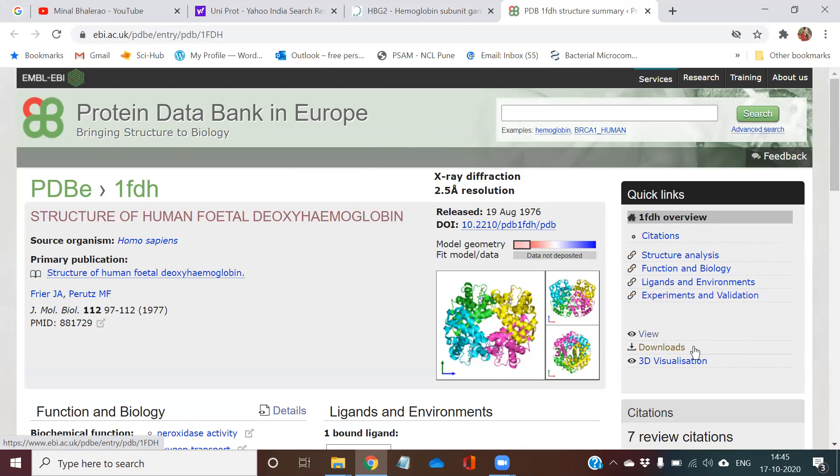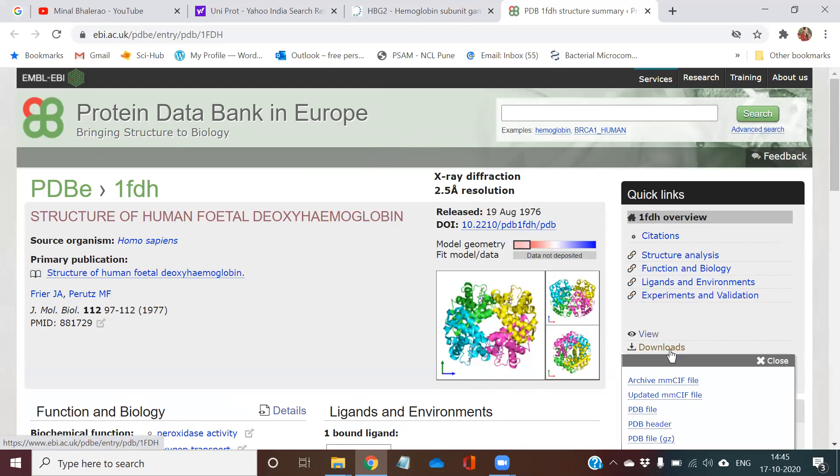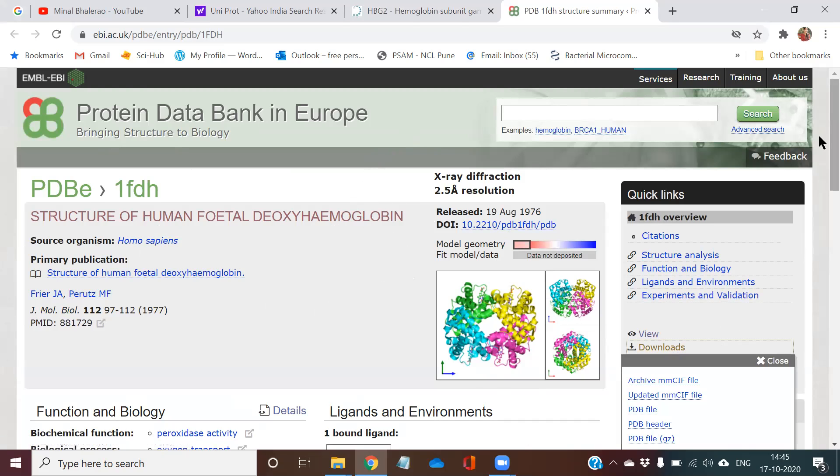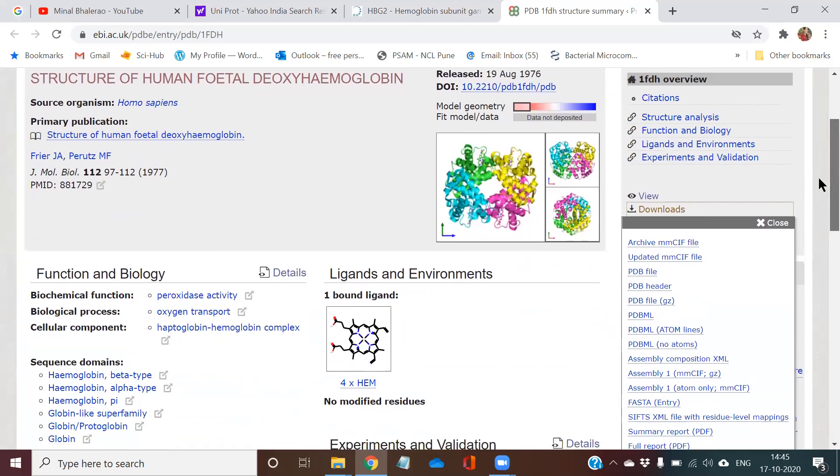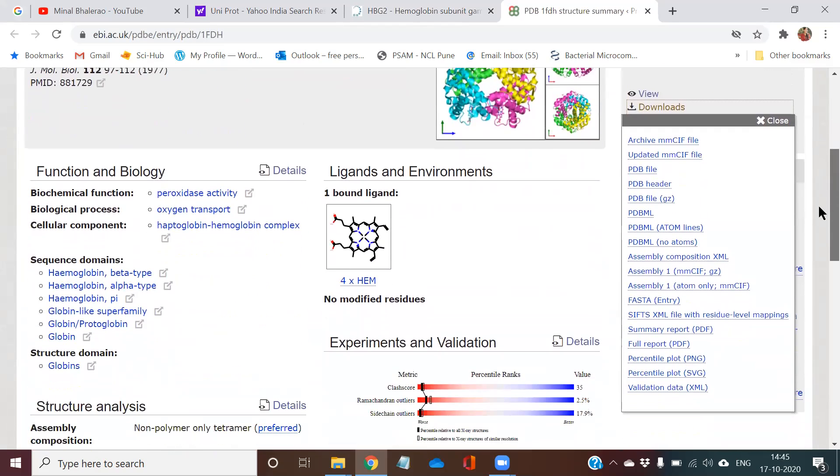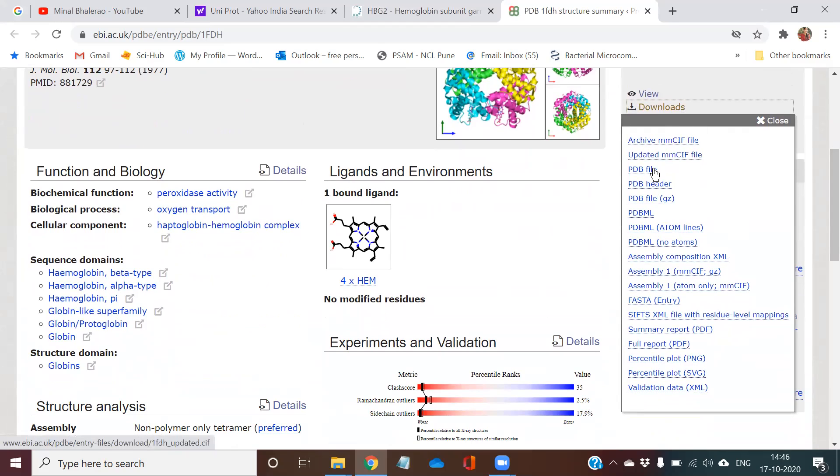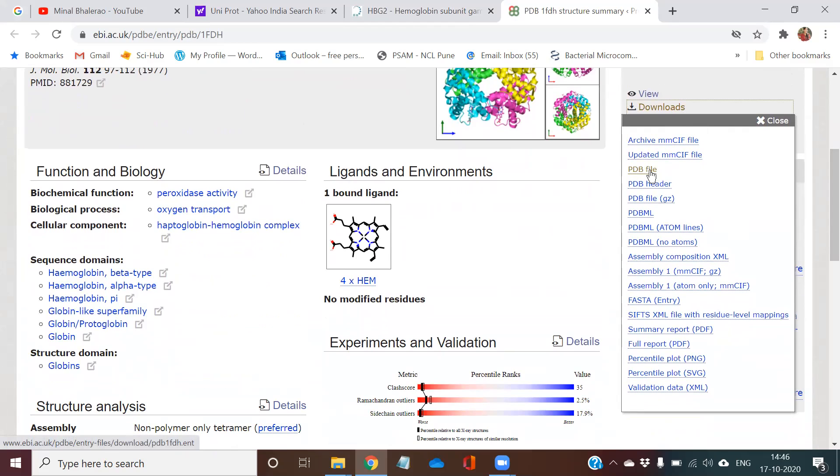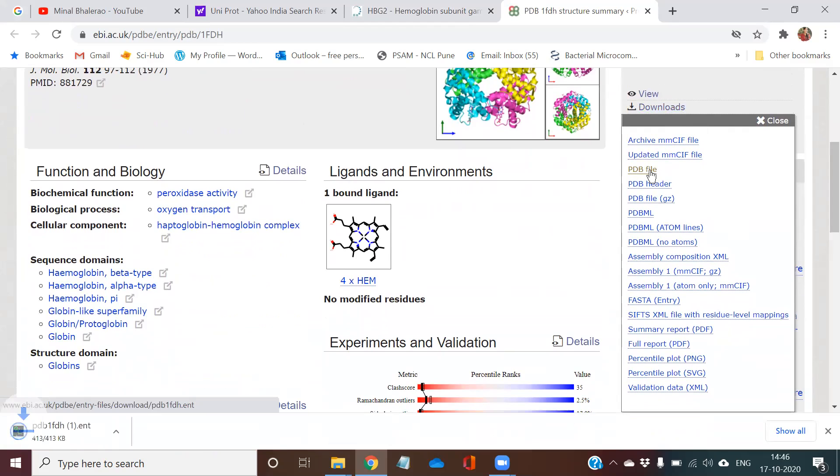To the right side, there is option called as downloads. In the downloads option, you are getting many formats. Like we have PPT format, Word format. So same way for downloading the protein structure, you have different formats. Now I am going to download in the PDB file, in the PDB format. So I am clicking on PDB file.